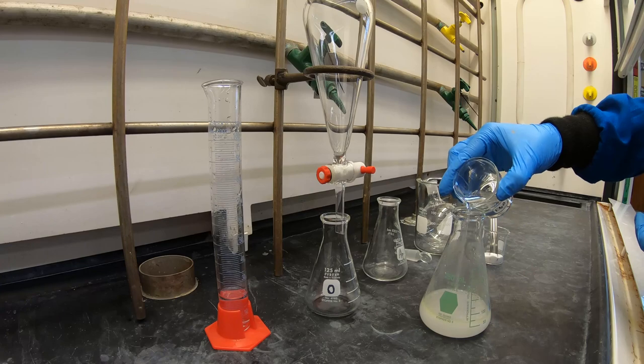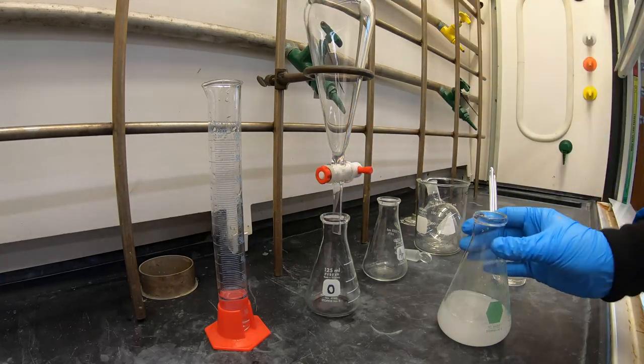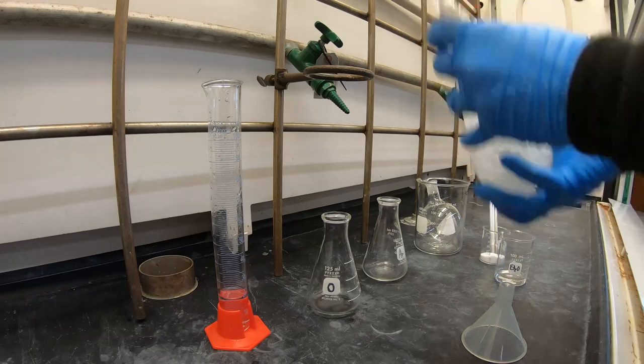Now add your first portion of ether to your flask, swirl, and then transfer to your separatory funnel. Add your stopper to the funnel and then thoroughly mix with shaking.